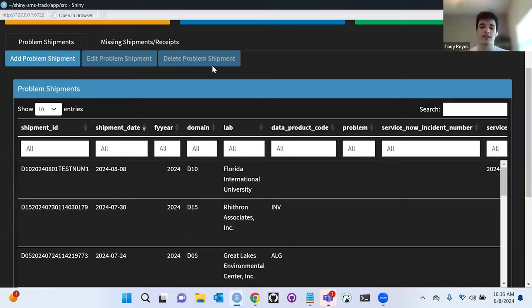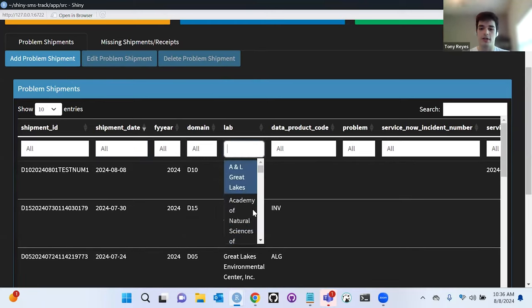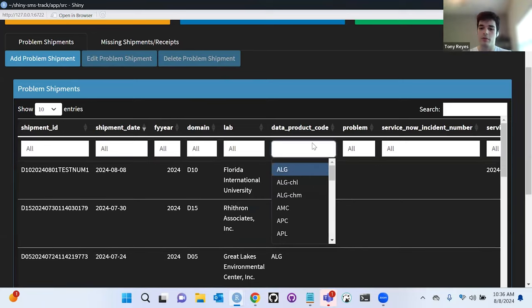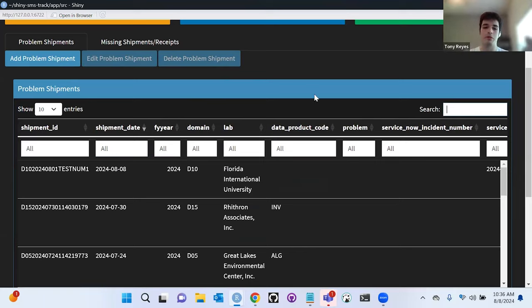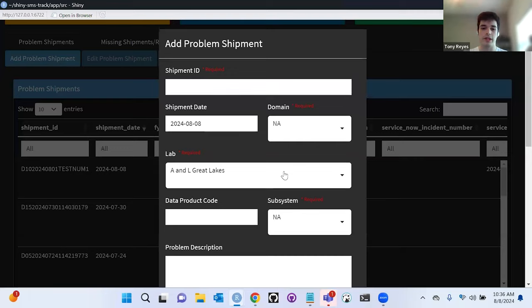Some neat things you can do in the dashboard: you can select a specific date range, select specific domains, labs, or data product codes, and more. Also, if you want to search for something specific, you can just click on search and type it in. And if the daily script is not catching problem shipments, you still have the ability to add one manually using this form.